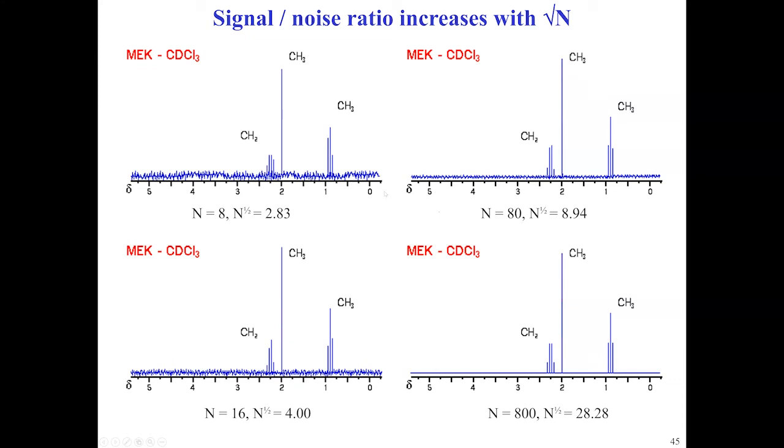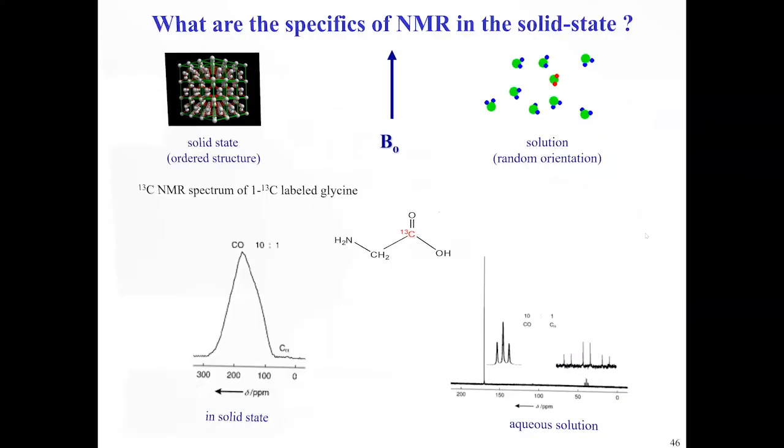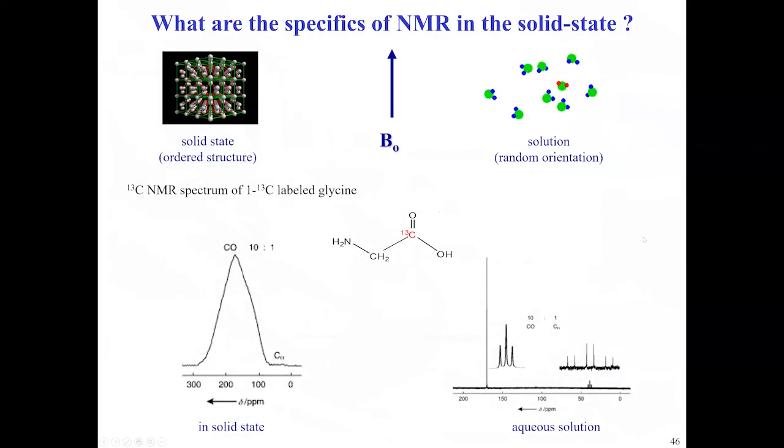So that's why we would record spectra or perform our experiments on and on again. You will remember the slide we touched upon, how to make solid state experiments more valuable, how to get atomistic detail of the experiment, right?